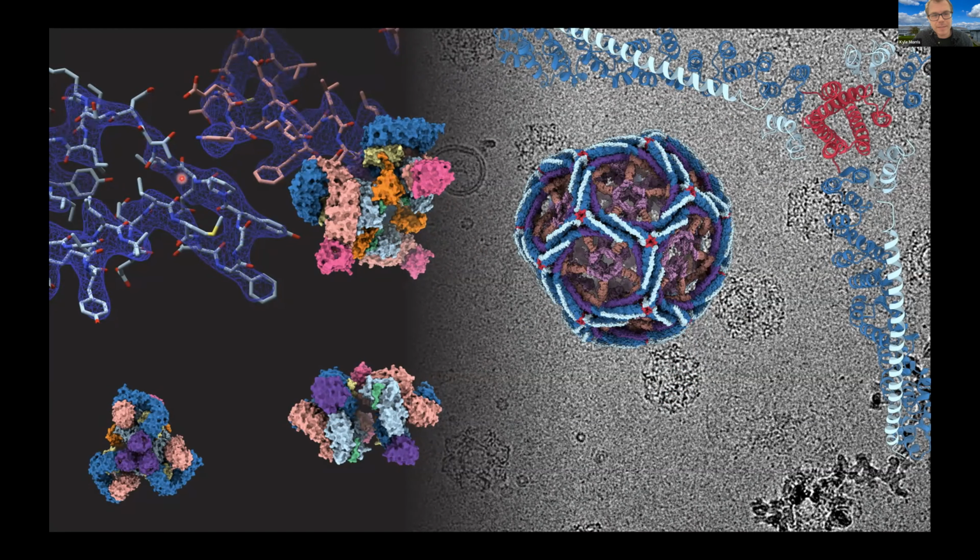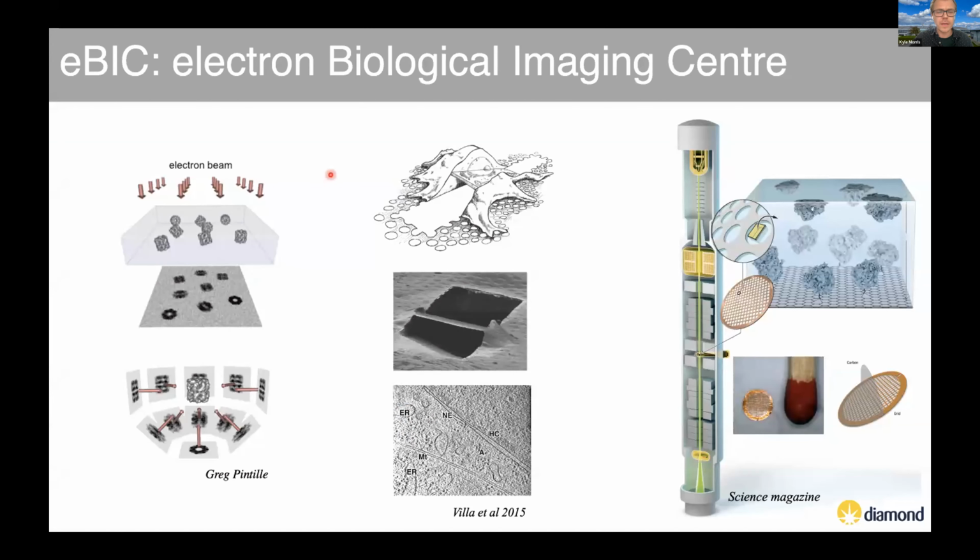This is electron density, and inside that electron density, you can model what the atomic structure of these molecules are. This is quite low resolution now, but it's mine, so I'm proud of it. But we can get much higher resolution than this, to the point where we can see atoms. And when you're getting to that level, then really you're talking about understanding the chemistry of biology.